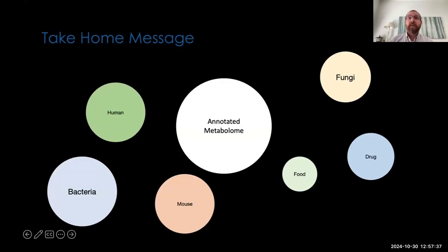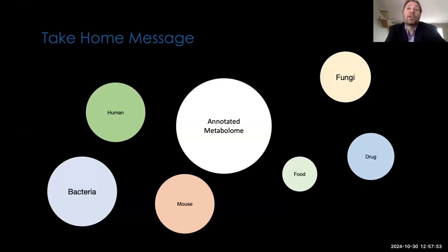Thanks for the great talk. With the foodomics, have you used spectral similarity to look at healthy versus disease group differences in the products of microbial fermentation or metabolism of the ingested food compounds? So I think this is a great question.